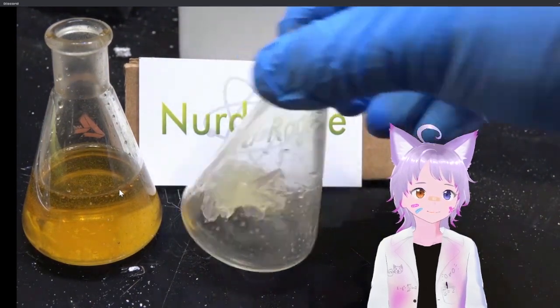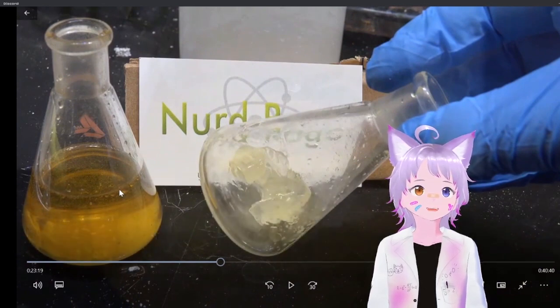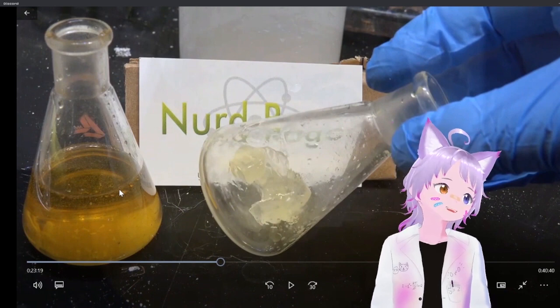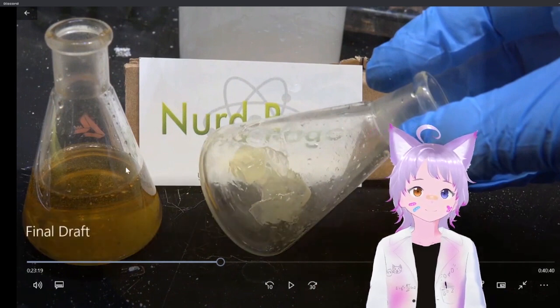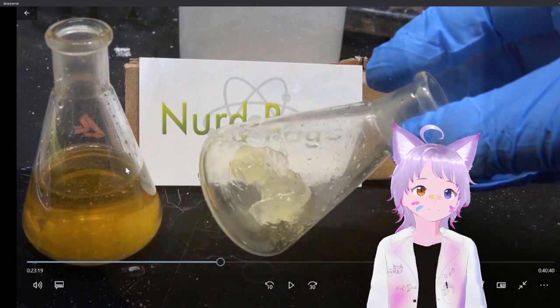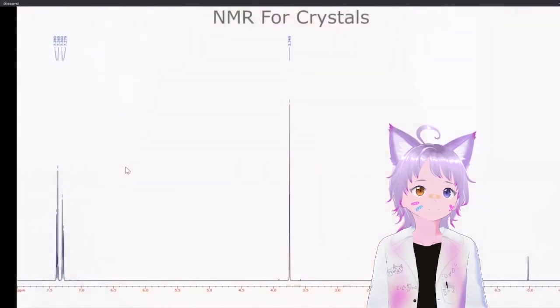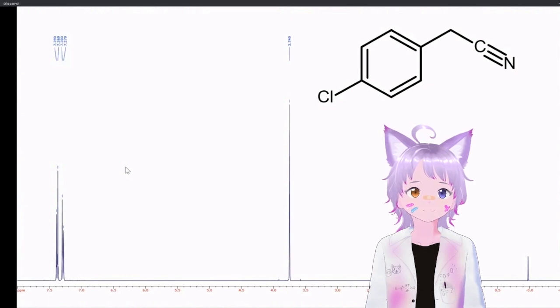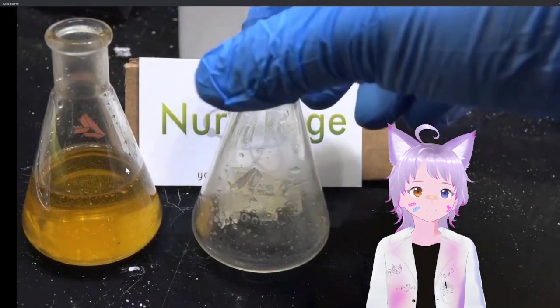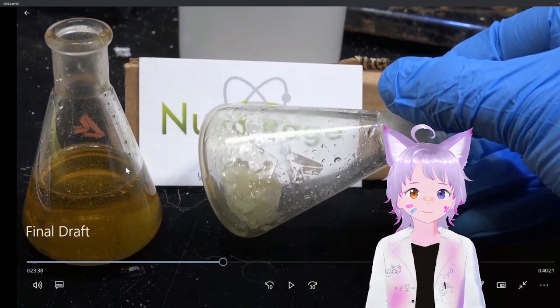Ah, that explains the 12%. Okay, but basically you could technically get more yield, but this only ex... Like what, yeah, he did a very slow crystallization, that's why. But he needed something pure, so there it is. And well, those crystals are so huge, of course they're that pure.